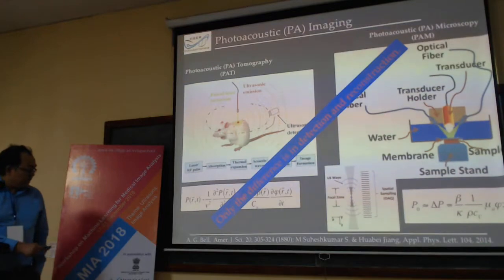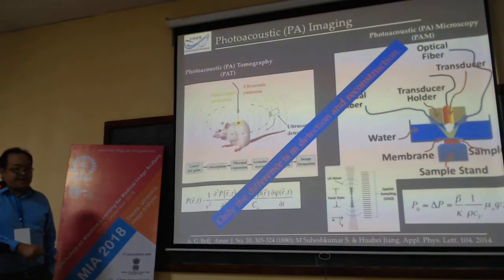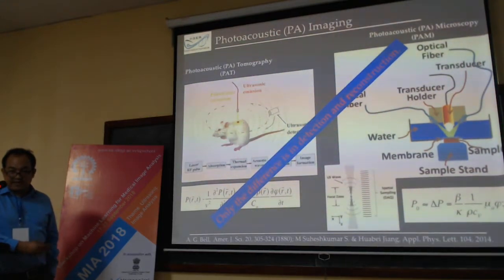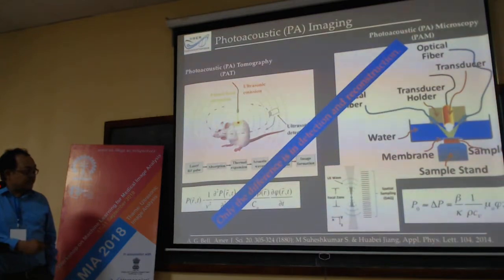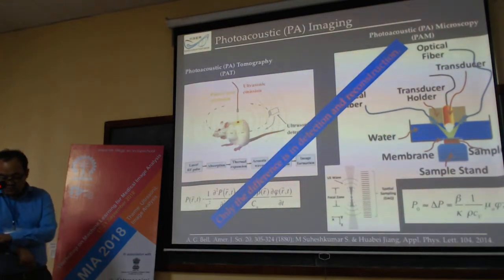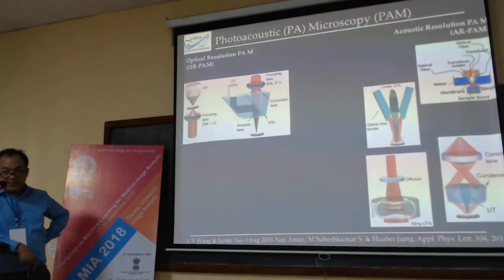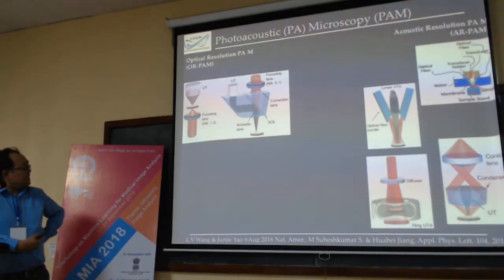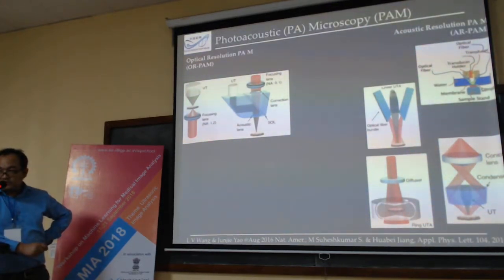So in this way, the imaging modality has the illumination part and the detection part. Illumination is completely the same. Detection as well as reconstruction are different in these two modalities. So I would like to bring up the state of the art in the design and development of photoacoustic microscopy. In this microscopy we have two categories. One is the acoustic resolution microscopy, and one is the optical resolution microscopy.